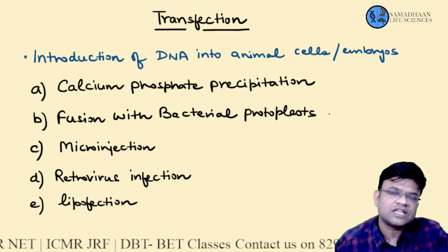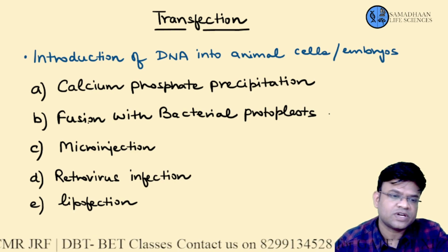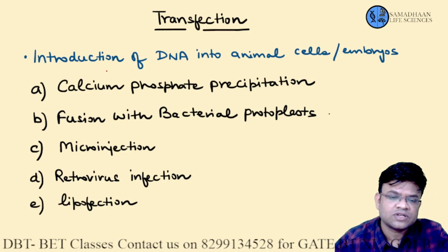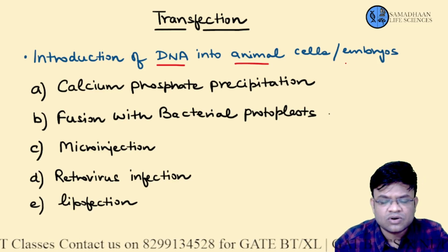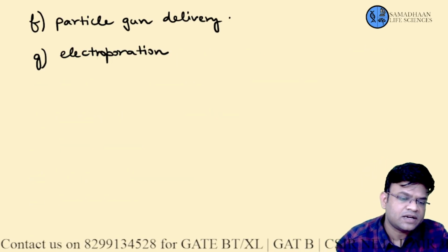So what is transfection? Let us first of all understand what transfection is all about. Transfection is the process in which we introduce DNA into animal cells or embryos. That means a foreign DNA, let me just write it down over here.